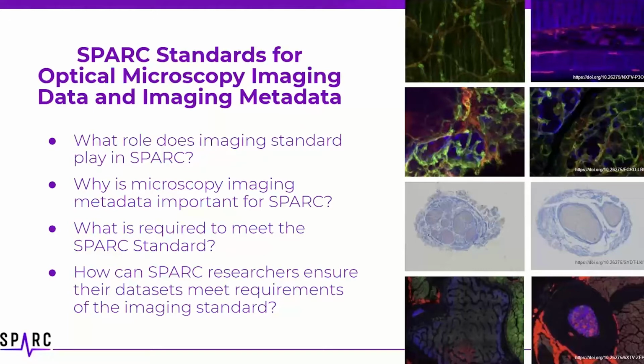Aidan, tell us what's required to meet the SPARC standard. So to meet the SPARC optical microscopy image data and imaging metadata standard, source microscopy image data within SPARC datasets must be converted to OME-TIFF and JPEG 2000 formats. Additionally, there is a set of required metadata that is needed to appropriately repurpose these resources. We'll review the required image metadata in detail on the next slide.